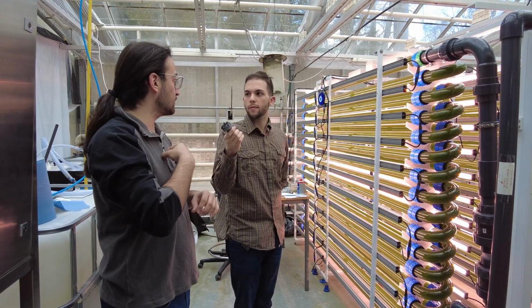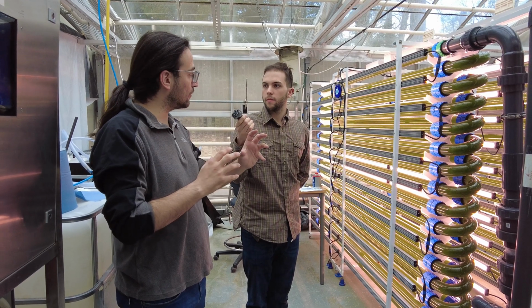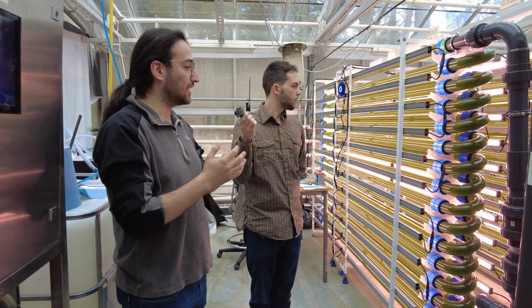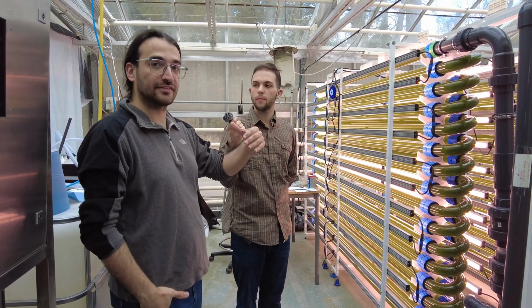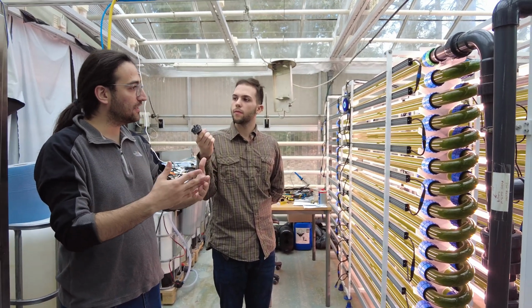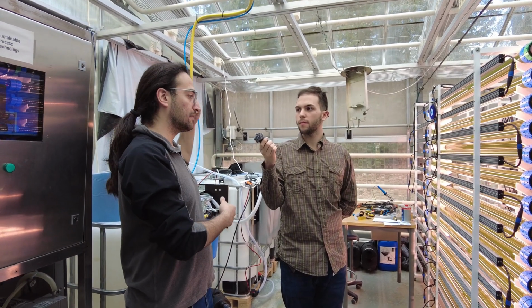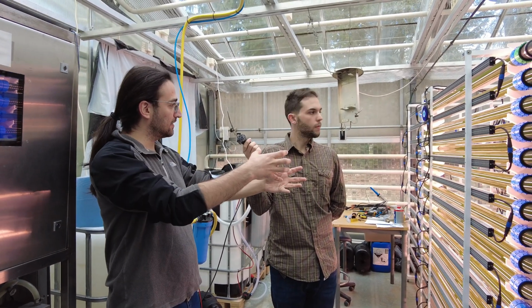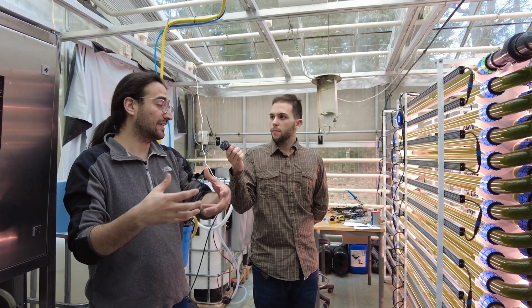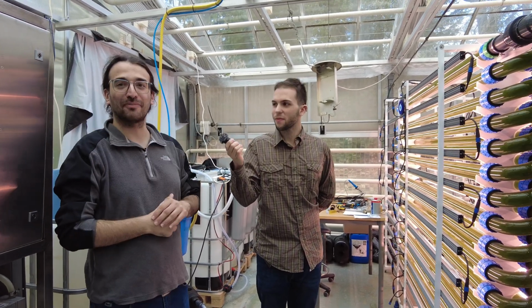But specifically for my project, with the team, we are checking the biostimulant, biofertilizer and biopesticide potential of algae, and we are seeing that it works. If you apply this algae to the plants, our plants are growing better or they are healthier, we are enhancing their features. So what does it mean? From the greenhouse wastewater, we created an algae as a biofertilizer, biostimulant and biopesticide, and we are able to use it back in the greenhouse again. So this is our story in this compartment.